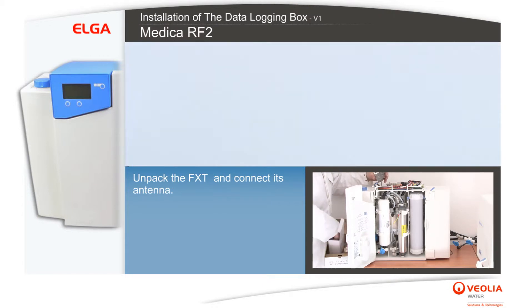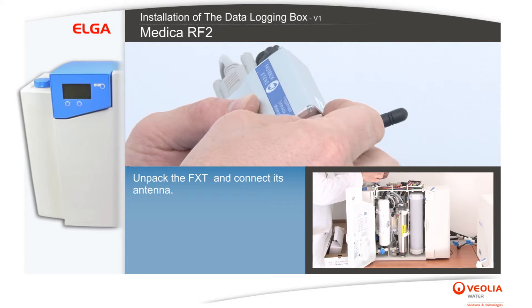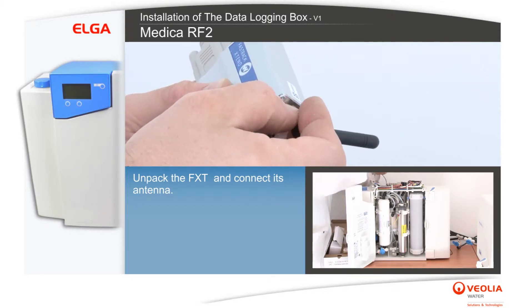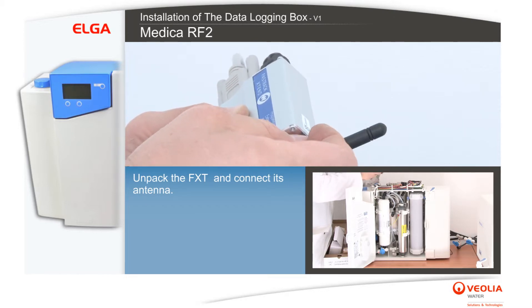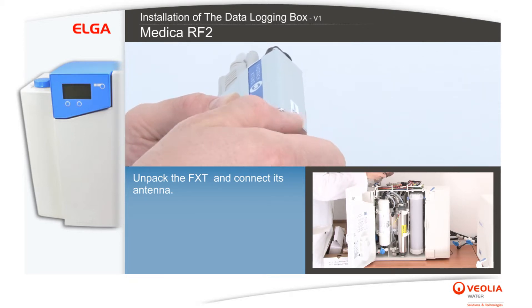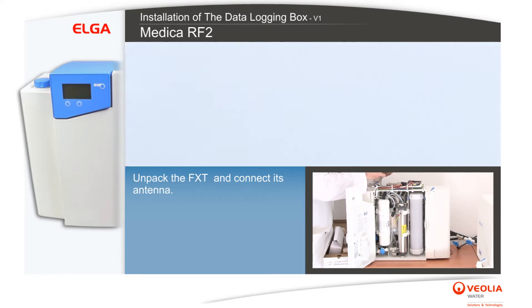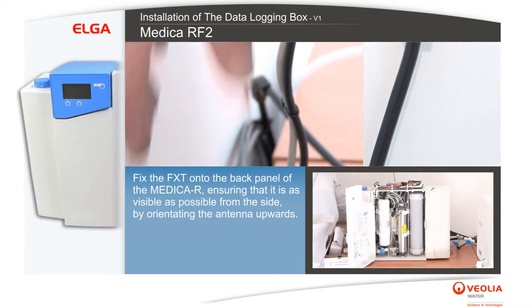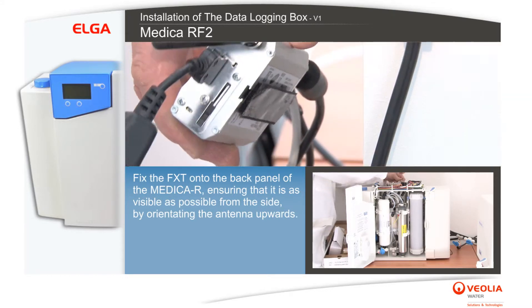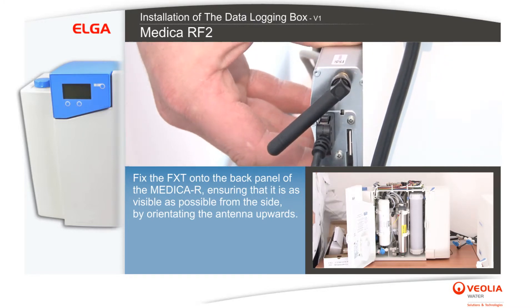Unpack the FXT and connect its antenna. Fix the FXT onto the back panel of the Medica R, ensuring that it is as visible as possible from the side by orientating the antenna upwards.